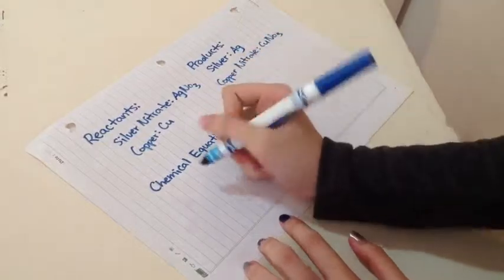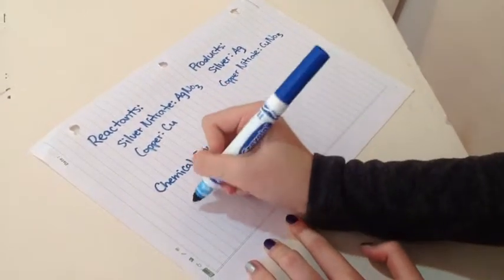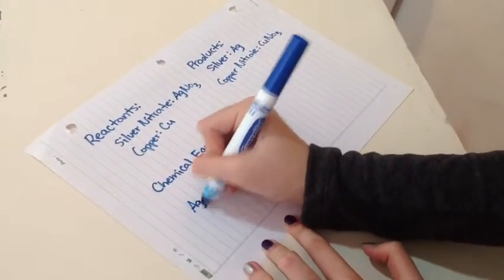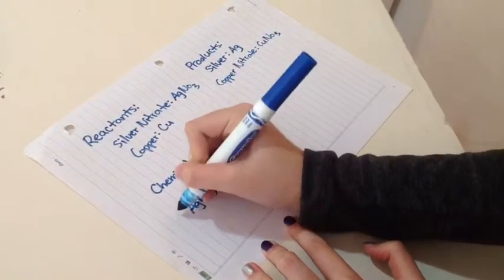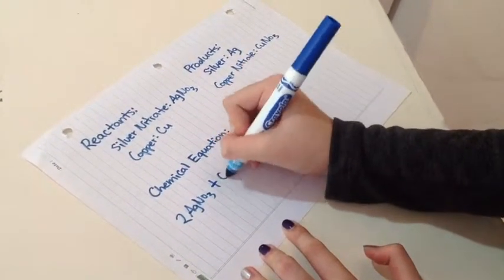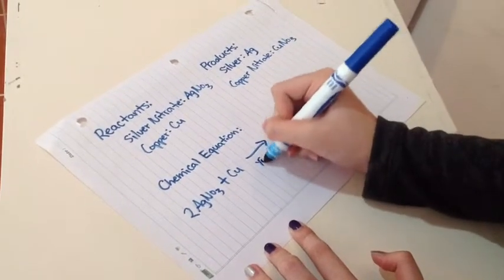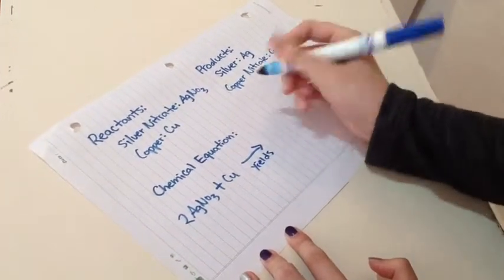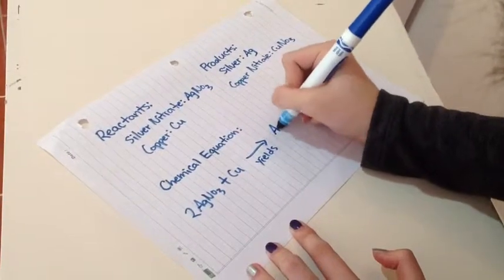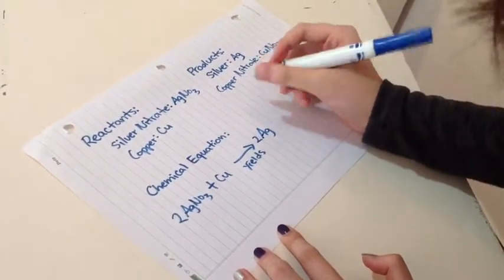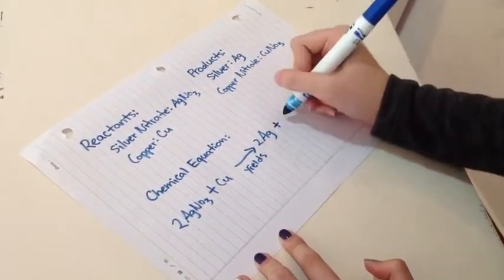So the chemical equation of this experiment is silver nitrate plus copper yields silver, Ag, and copper nitrate.